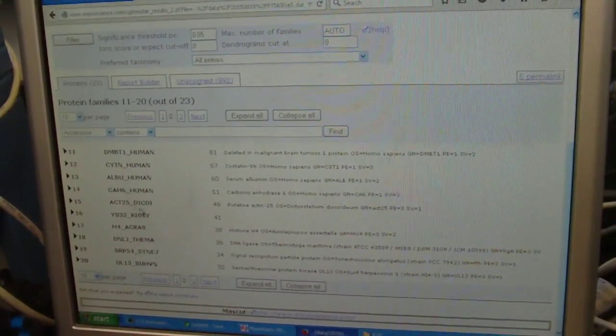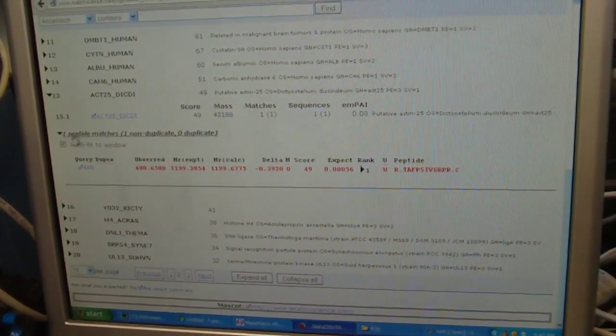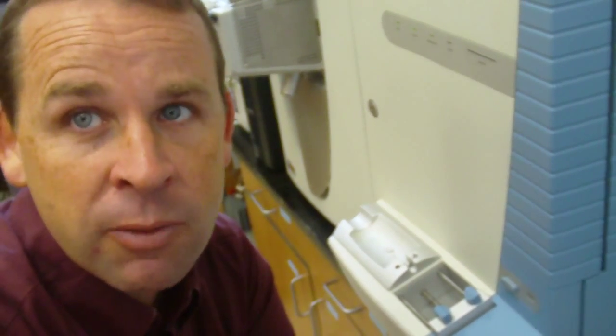Here's a lot. Here's one that's above 40, and it's not human. So we can look and see if there's a same set. There's no same set there, so, you know, that sort of thing is interesting. It's hard to say exactly what it means, but there's no same set, so that's not going to be our field of data. If you start seeing trends, though, like that, you don't want to let them escape you, right? I mean, we're not going to have you collect every single protein. We're just going to go for the human ones. But if you start seeing, hey, I see that this one is always in people who have diabetes, then it could be a protein that's not identified as human because it just hasn't been discovered yet, but is in our genome and could be useful for some reason. Does that make sense? So you don't want to let those things escape you.